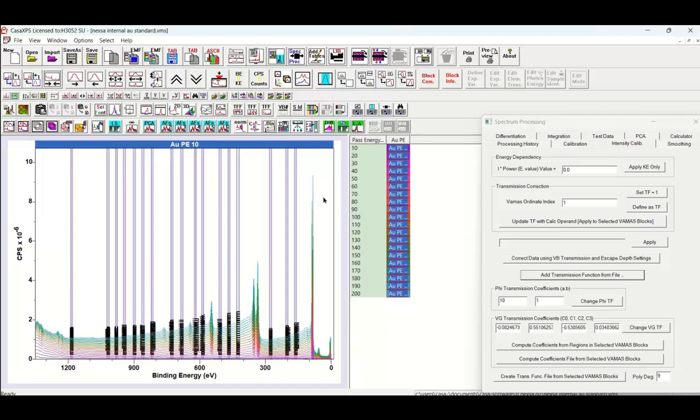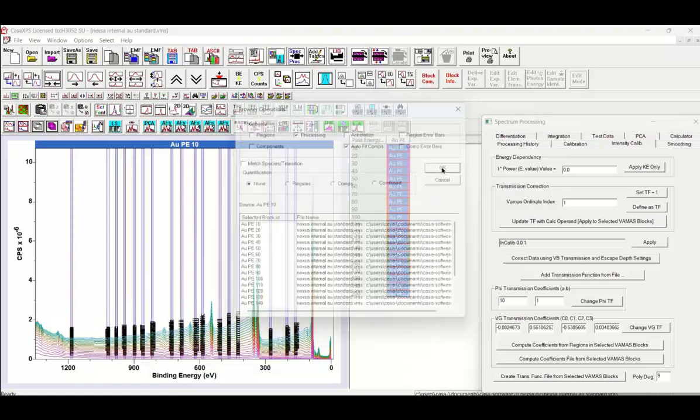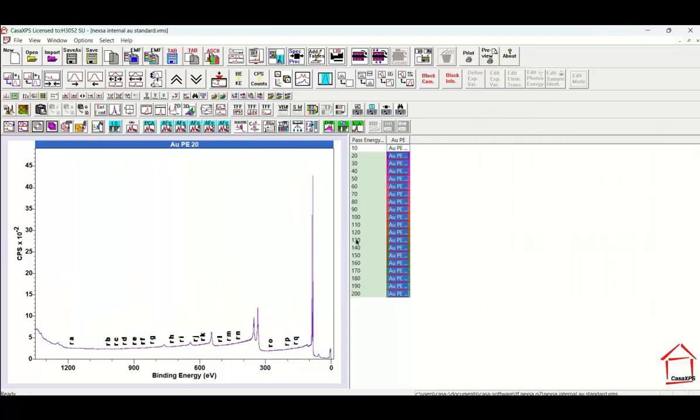This is now the acid test, and that is, let's correct the spectra and observe how well we get an alignment. In fact, the remarkable thing here is that we've got an alignment pretty much even for pass energy 10, but you can work out the kinks in the background and the transmission to give you something that looks very, very similar to all these other data. So let's just step away from that and close that so we get to see.